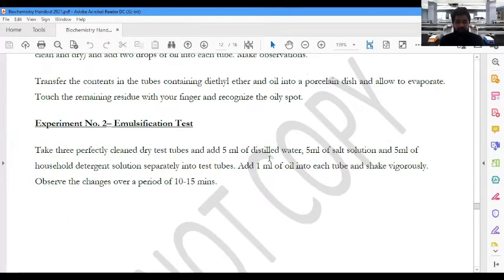Br2, Edgar. Yes, very good. If we add bromine water to fat or whatever compound we need to test for saturation and unsaturation, and there are double bonds, the Br2 will lose its color.